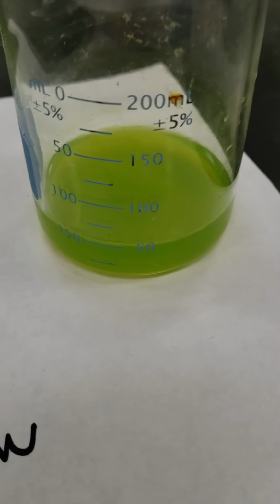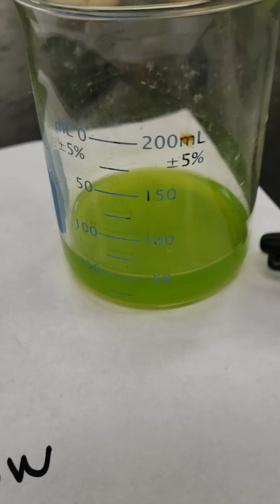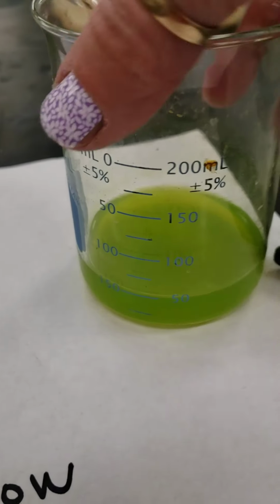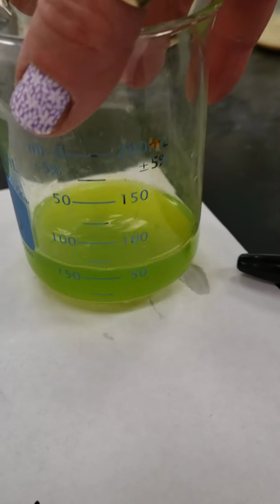And then the last thing we did today, I took some spinach and put it in some hot water. This was alcohol in this beaker. And I was able to pull the chlorophyll right out of the leaves. So there's the chlorophyll.